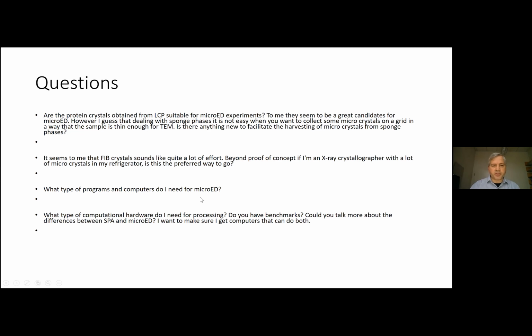So what type of programs and computers? For the programs, you need the standard X-ray crystallography programs like DIALS and MOSFLM to do the processing, and I think a lot of them have the scattering factors for electrons built in. For a computer, you don't need very much. I don't have any benchmarks, but if you have a computer that will do single particle, you're fine for MicroED.